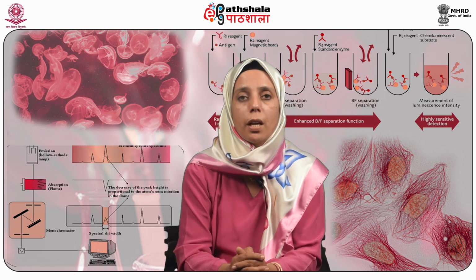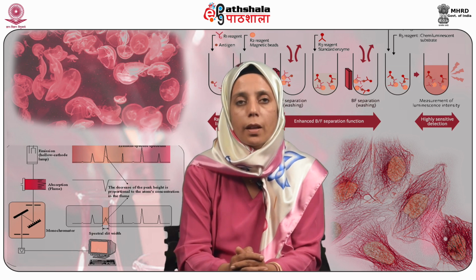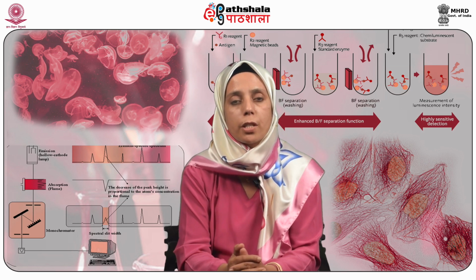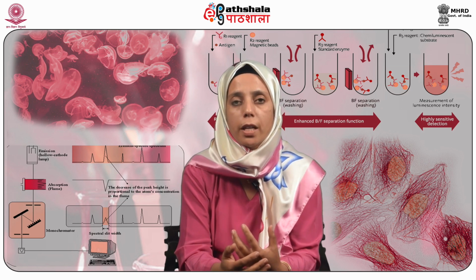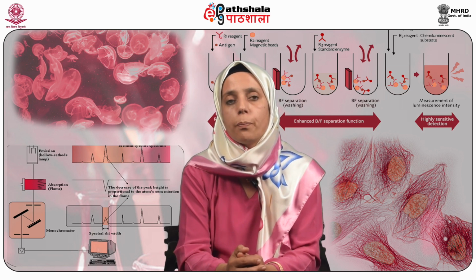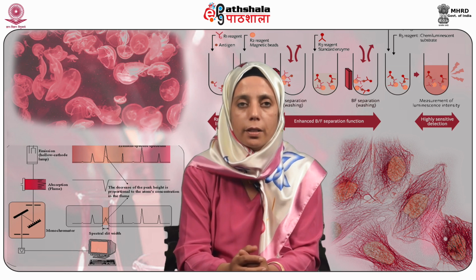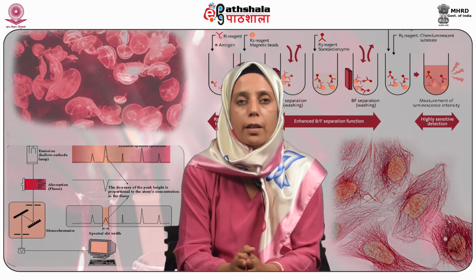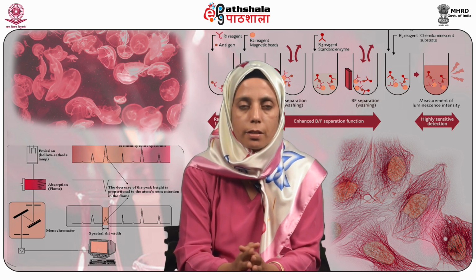That means it should be able to detect light. It should have a good sensitivity. The frequency of response, that means it should be very fast. The response should be speedy. Also, stability is an important factor. Then one of the most important factors is cost and convenience.